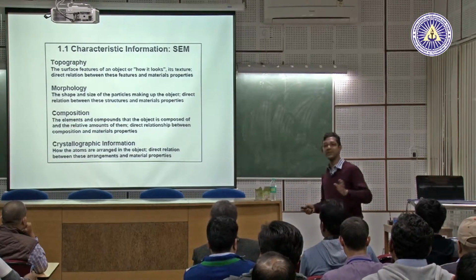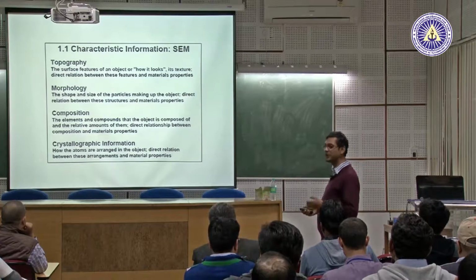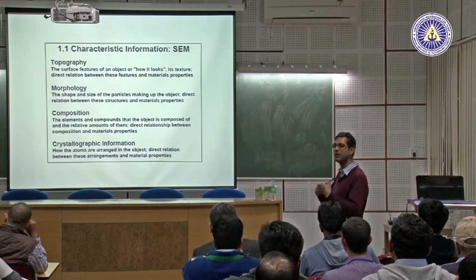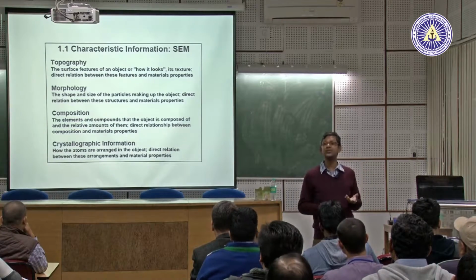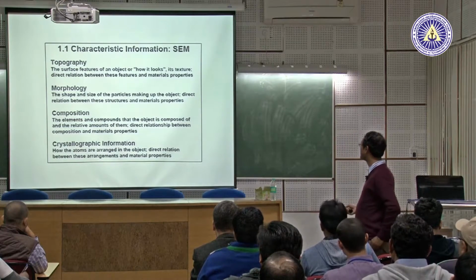Second is the morphology of phases. This is what physical metallurgists like us do. We prepare a sample, we want to see what is there inside. Okay? We have not broken the sample. We simply pick a sample and see. Then third one is the composition of different phases. You can either use EDS or WDS depending on the money you have.